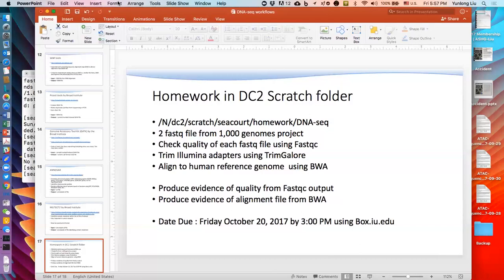I would give it just a few months to make sure that the bugs have been worked out, and that some of the concerns that are coming up and the inconsistencies that are going to happen with GATK 4 right now are worked out, because they're in beta right now. If you go to the GATK website, you can download 3.8, but 4.0 is in beta. You can contact them for testing privileges, but right now I would let them work out the bugs on 4.0 before I tried to move into it. You may want to download it and play with it and see what you get, but my trust of the data would still be with 3.7 at this moment because of the consistency over the years.